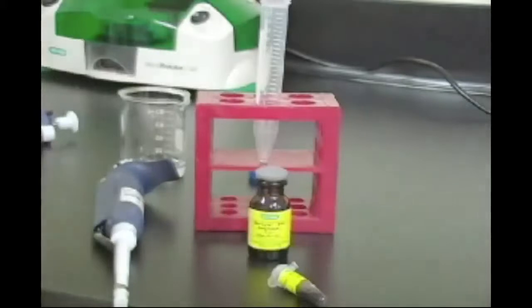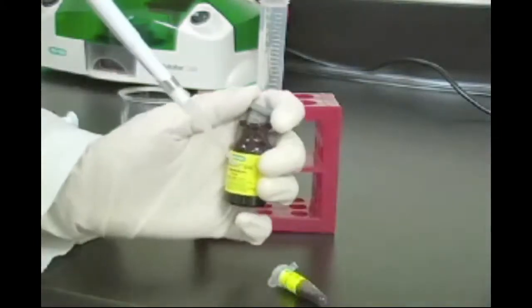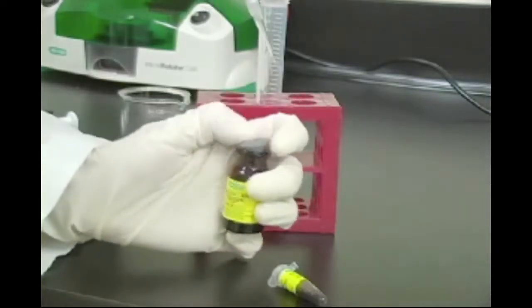To prepare the sample, take 100 microliters of protein sample and add 150 microliters of biolites pH 3 to 10 and 2.75 milliliters of deionized water for a total volume of 3 milliliters.